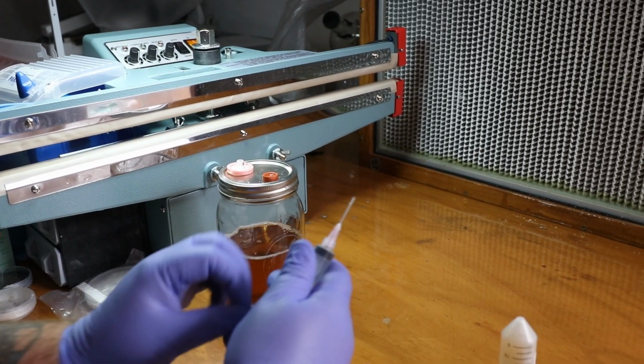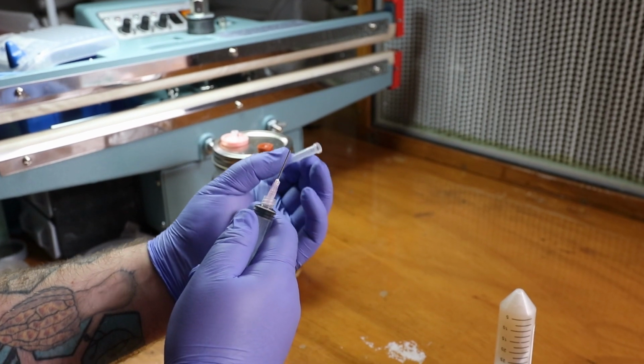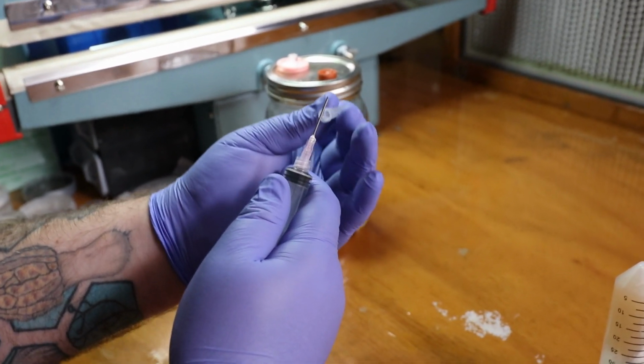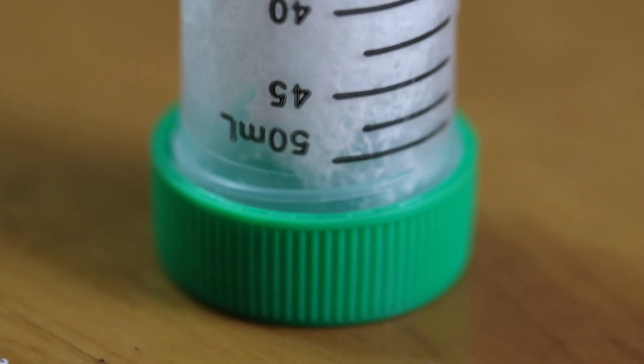I just wanted to be able to come back and show you guys the pistol grip again and how we scoop that needle cap back on. This was shown to me by a lab tech that I had hired for a while, and I really do like knowing the actual safety information.